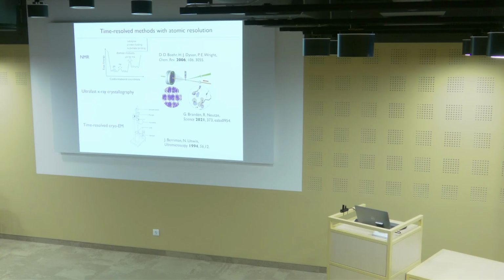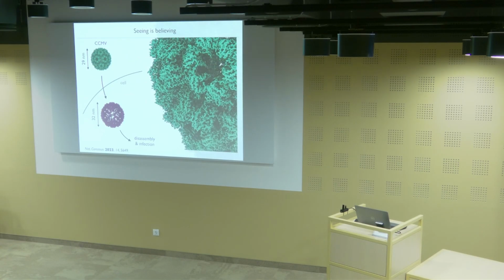Which is, again, 3 orders of magnitude too slow for what we want to observe here, right? So in other words, this process cannot be observed. There isn't a good way to look at this. And so then you could argue that if we're always limited to looking at static structures of proteins, then really understanding how proteins work must be incomplete, right?